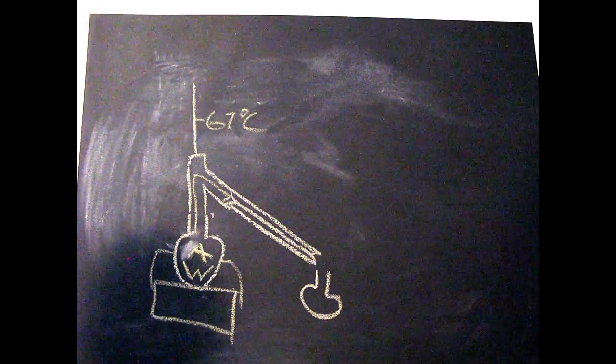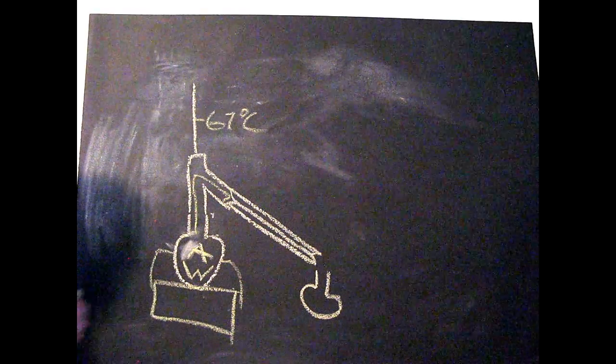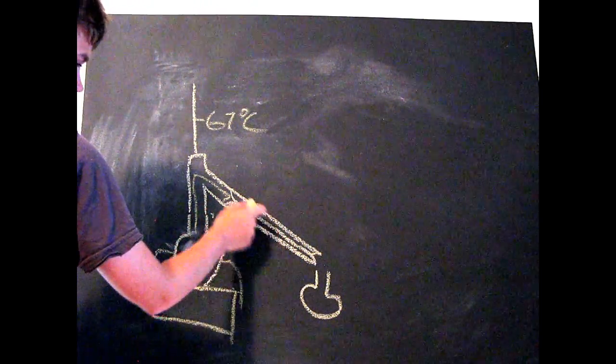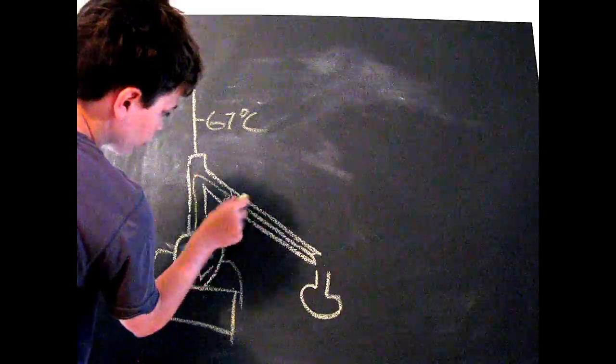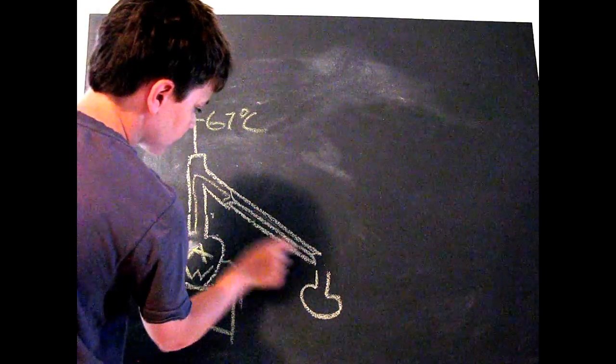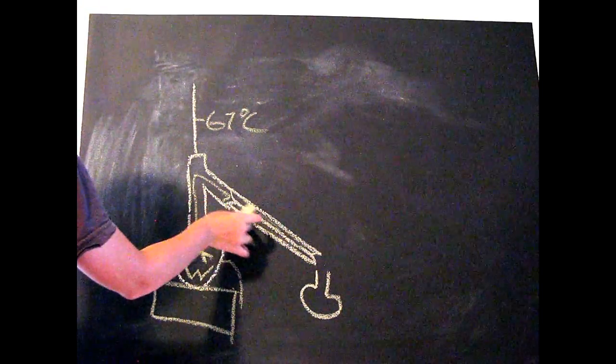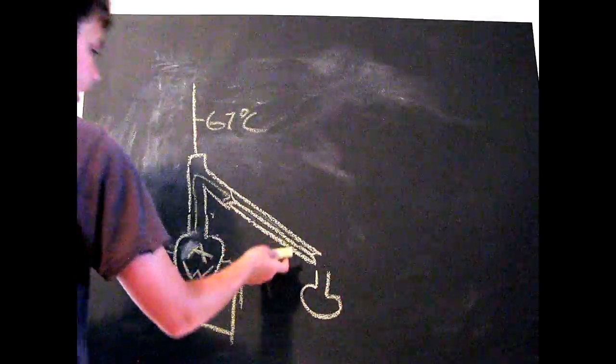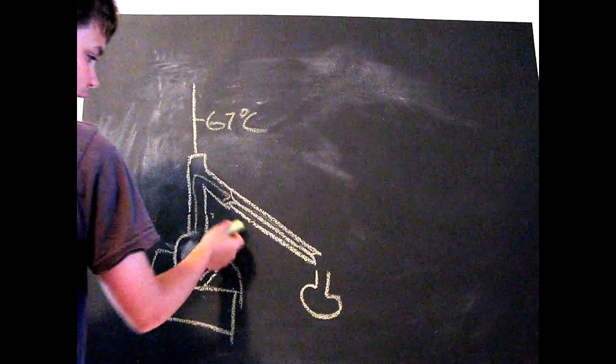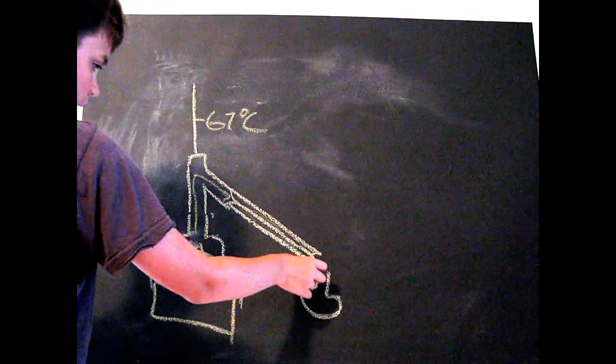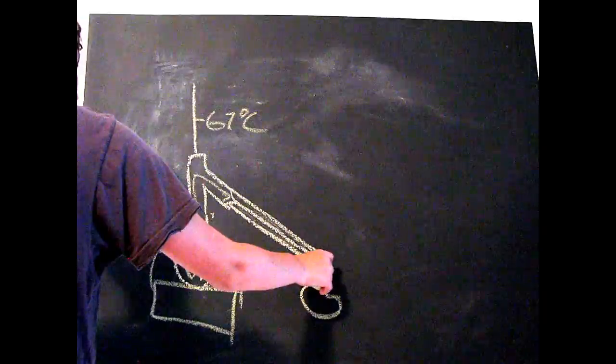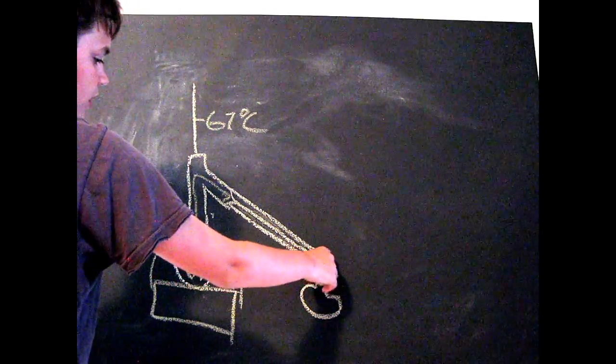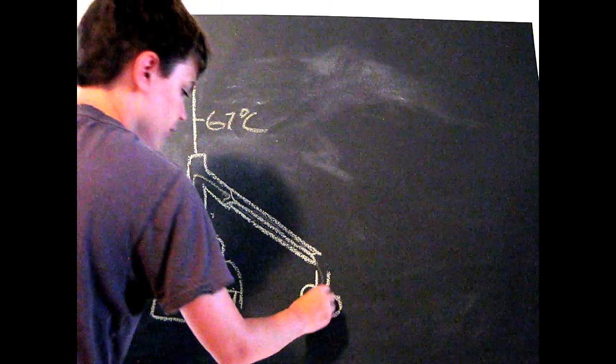The condensing column is a thin tube of glass with a big shell of glass out of it with cold water running through here. So the hot gases will be forced through here. And the acetone will be cooled down enough that it will all become a liquid. When it comes out the other side of the condensing column, it will come out as a liquid and drop into whatever receiving flask you have.